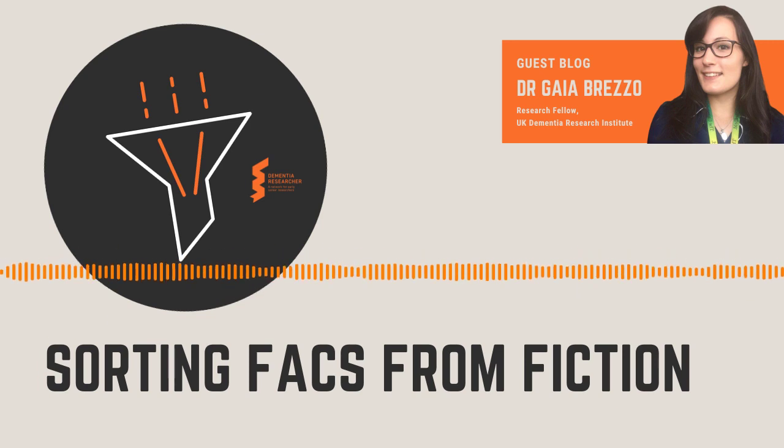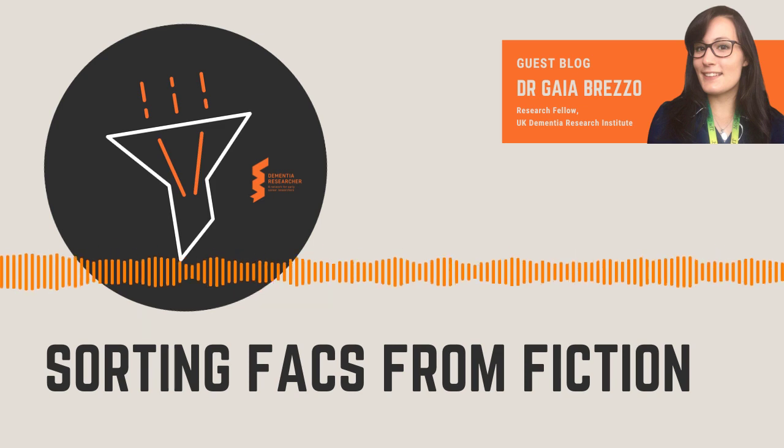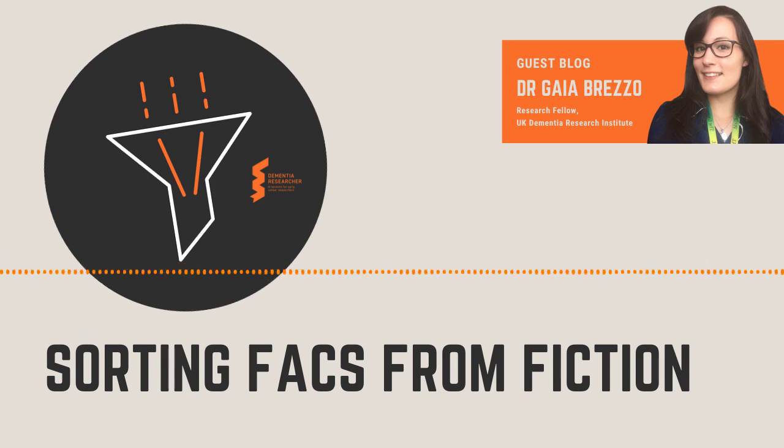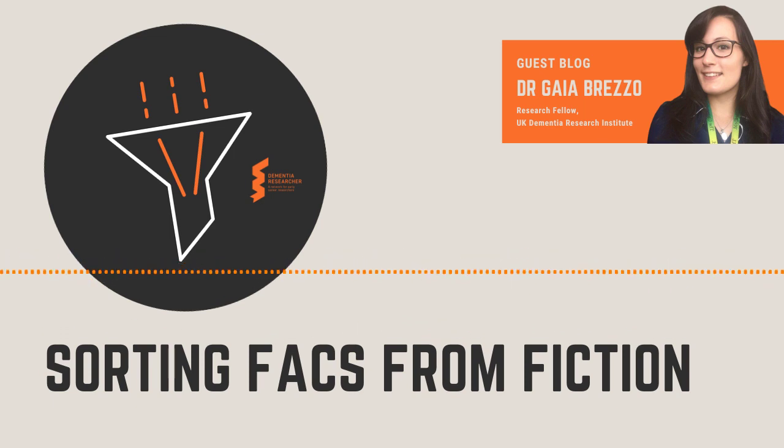Sorting facts from fiction. If you're an immunologist by training, you might have had a wee giggle at the title of this blog. If you aren't, fear not. I hope that by the end of this blog you will see the pun too. Today I'm going to take you through the principle of FACS, why it's such a bread and butter technique in the field of immunology, and how I'm using it in my own research.